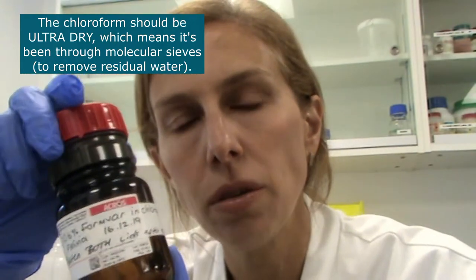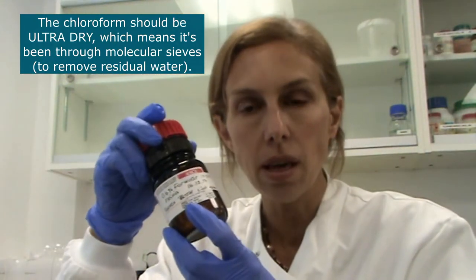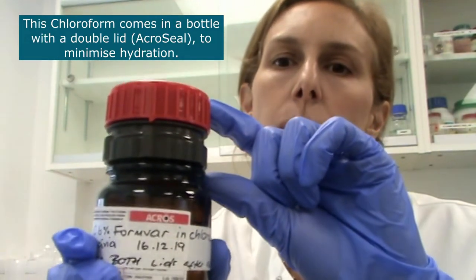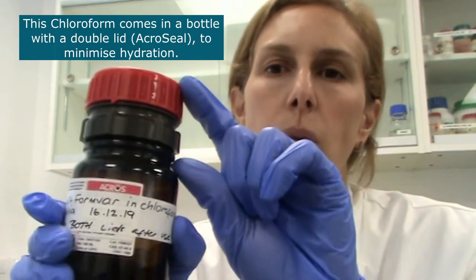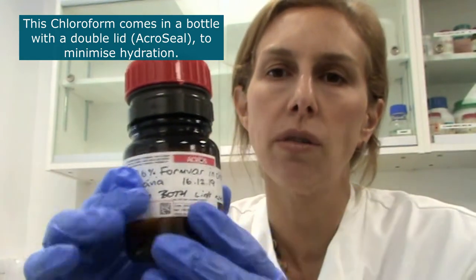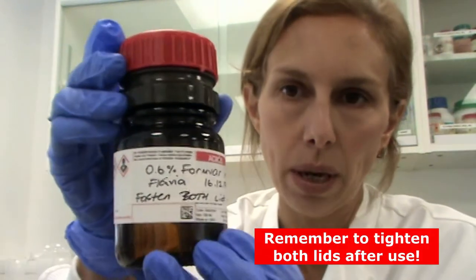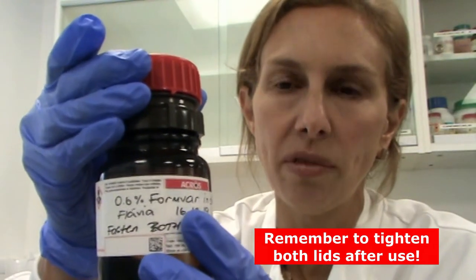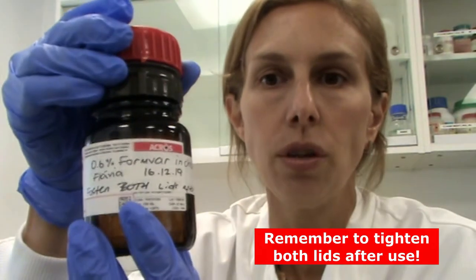The chloroform I use to make this formvar is the one that has been through molecular sieves, and it is kept in a bottle with a double lid to make sure as little water as possible comes into the formvar, so the formvar does not hydrate with time. You just have to be careful, because this bottle has two lids. When you use this formvar, you have to make sure you have closed both lids after use.